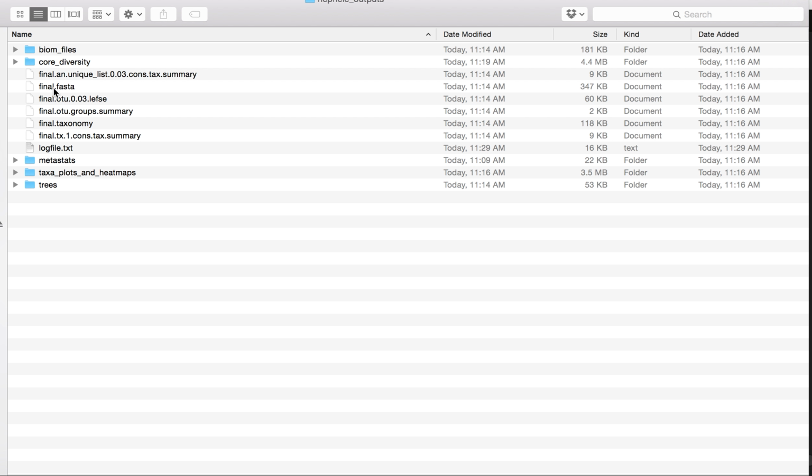for your run. It is possible that some of your samples had low OTU numbers. Those samples would have been filtered out. This final file only contains information that was used for all the analysis you see here.